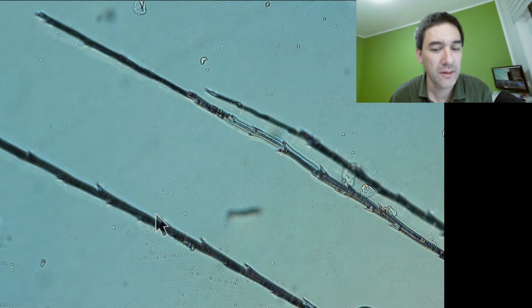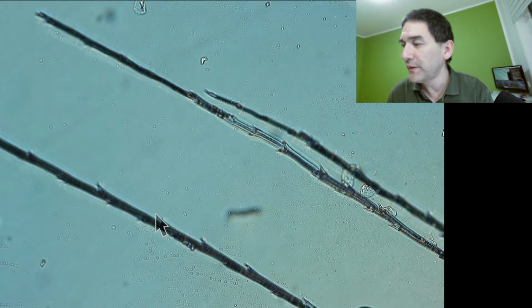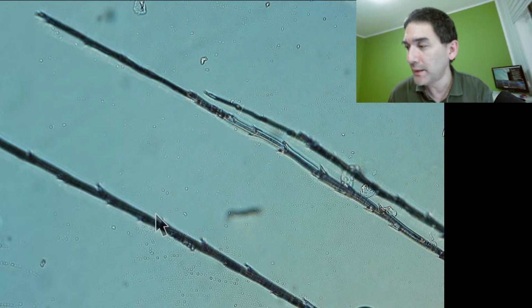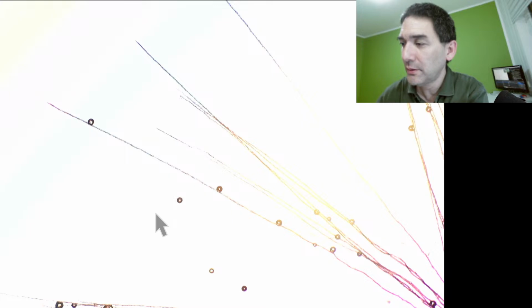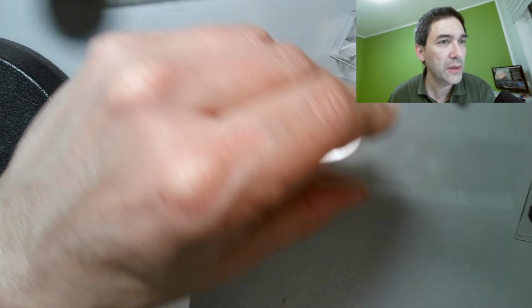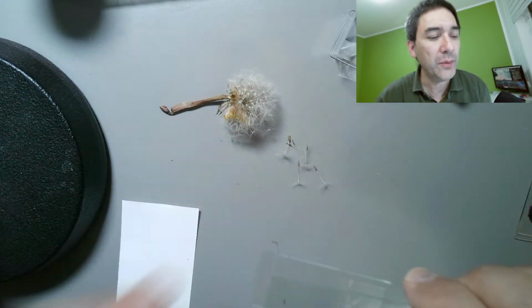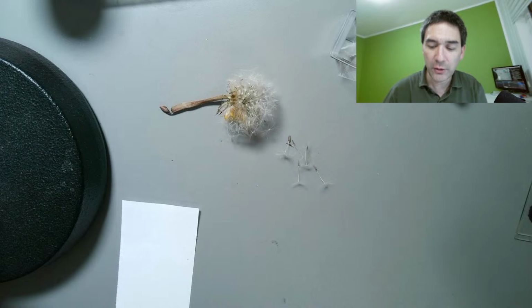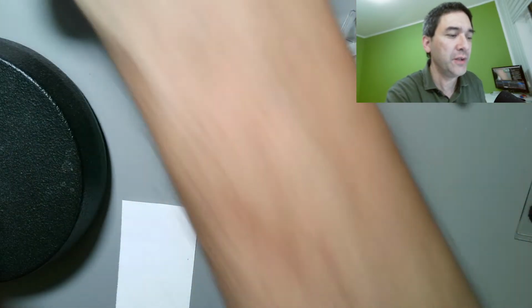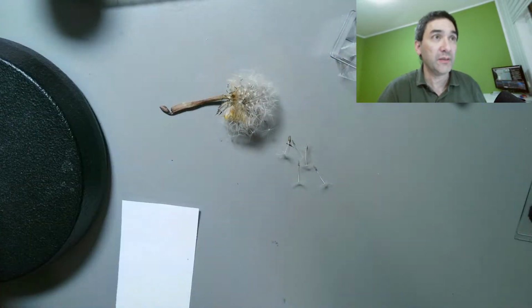Okay. And two more things that I would like to show you, the hair. Let me put those away. With those, I'm not so much concerned about the slides because they are not so problematic. But the one with the bacteria, I usually give special treatment. Usually I drop over some alcohol before I wash it, or use some detergent or very hot water.